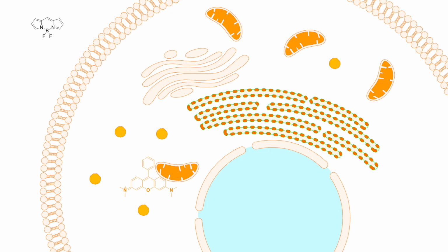And the membrane of the plasma membrane is the thickest, and then the Golgi and ER membranes get thinner and more flexible. If the molecule is neutral and has reasonable hydrophobicity, then depending on their hydrophobicity, they can selectively bind to Golgi or ER, but usually the staining tends to be fuzzy, because this only relies on their physical differences.